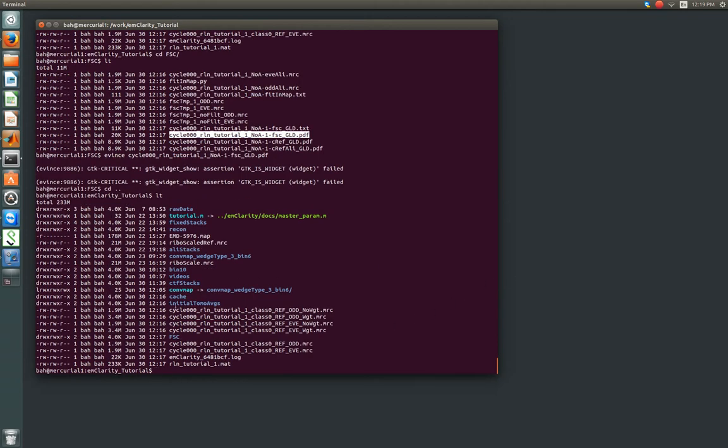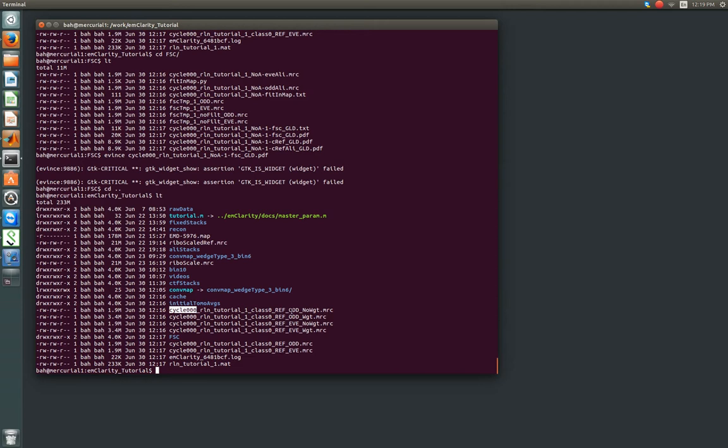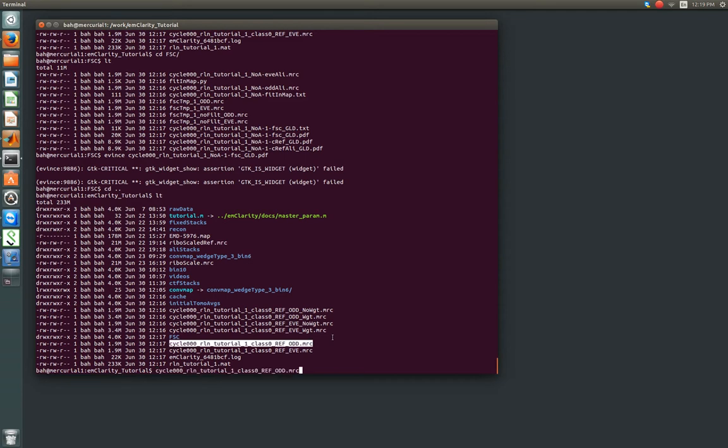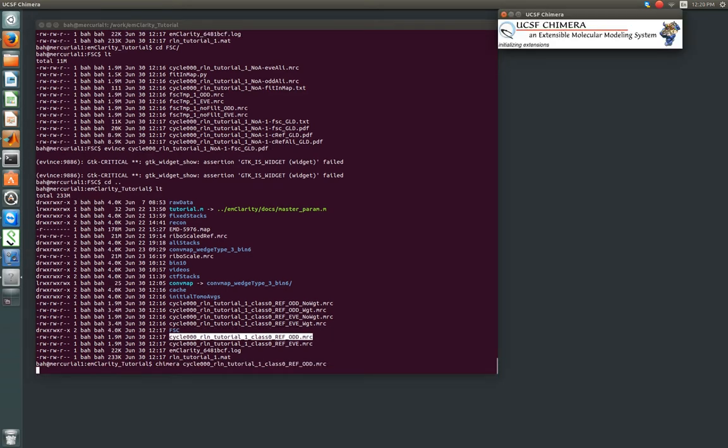Alright, other files that have been generated. So we've got these things that are prefixed, Cycle00. Then our project name. Class 0 just means there's no classes. So if there had been different class averages, they would have numbers. And then we've got our even and odd half sets. The no weight is the raw subtomogram average, with the exception of a quality weight that will apply in subsequent rounds. The weight is the cumulative CTF that's added up for that given set. And that's used to then create the final weighted average, which we can take a look at for the odd half set here, by opening it in Chimera.